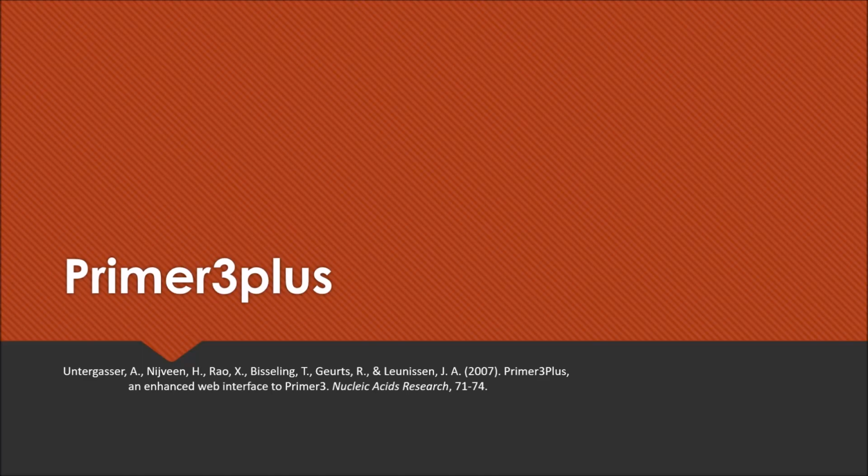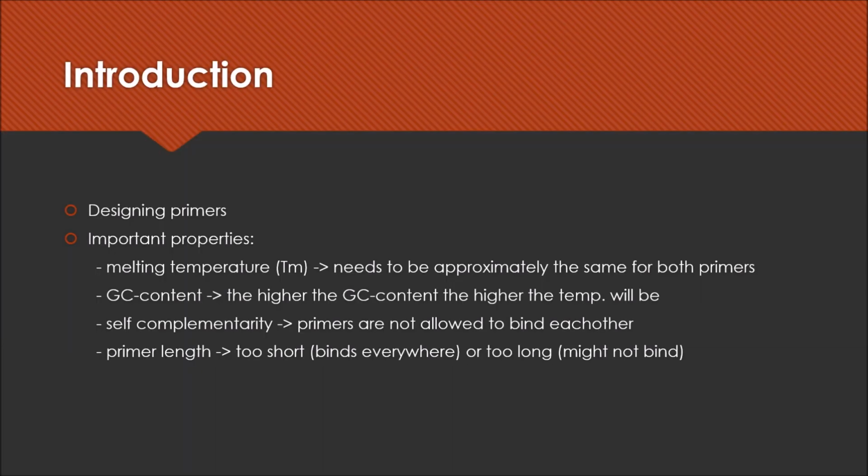Hello everyone, today I will explain the Primer3plus web tool. This explanation is based on the publication in Nucleic Acids Research named Primer3plus, an enhanced web interface to Primer3. The purpose of this tool is to design primers, which can then be used for many different purposes.